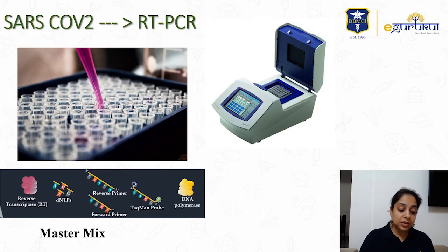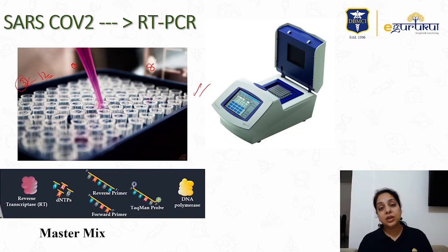So here, this is the 96 well plate, an example of the 96 well plate, not exactly. In this, first of all, this matrix is like 8 by 12. So 3 out of 12 are used for the controls. The rest, like an 8 by 8 matrix, is used for the samples. And now you can well imagine how many samples you can run at one time.